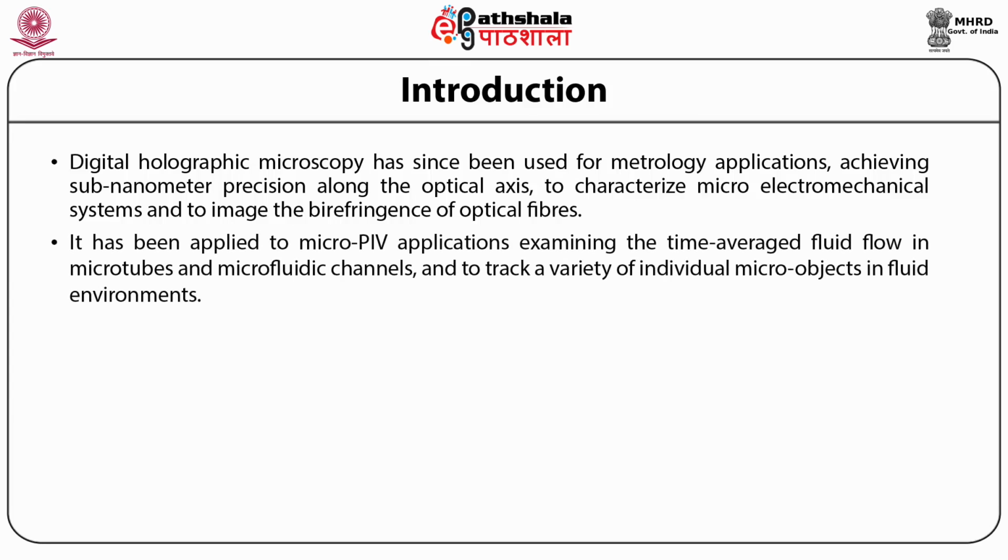It has been applied to micro PIV applications, examining the time average fluid flow in microtubes and microfluidic channels, and to track a variety of individual micro-objects in fluid environments.